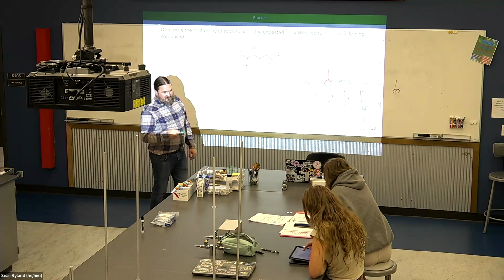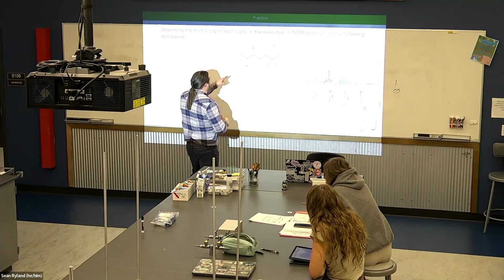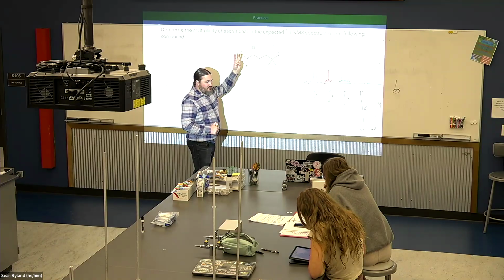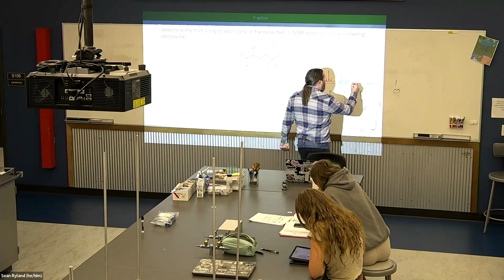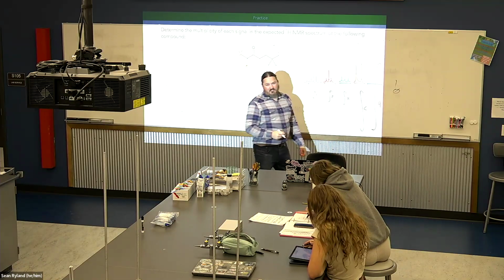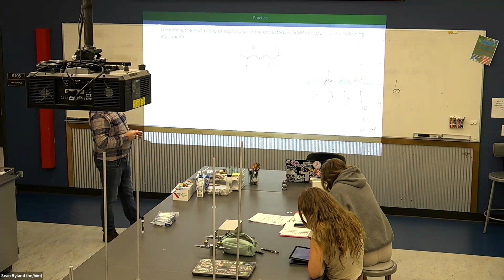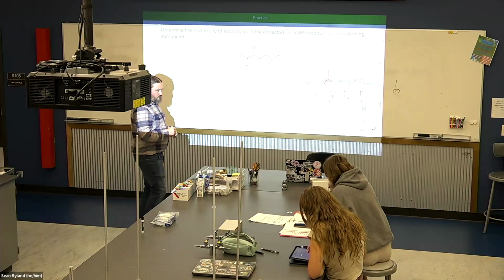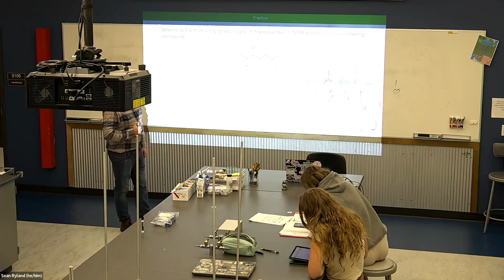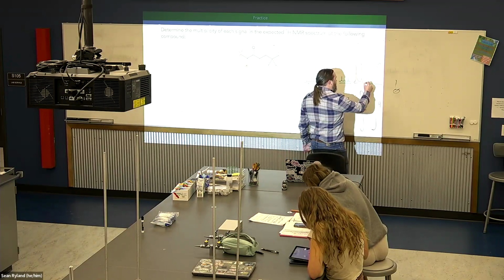How about the orange ones? How many nearest neighbors? One nearest neighbor, just the purple one. So the multiplicity then is 2. So we just see a doublet. Are those the same size? They'll both be the same size, roughly. And the blue ones have no nearest neighbors, so it's just a single peak, a singlet.